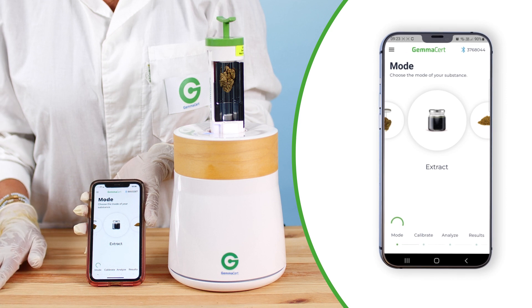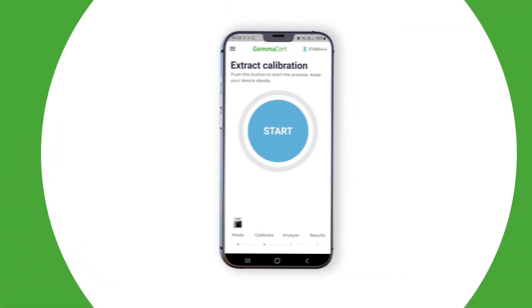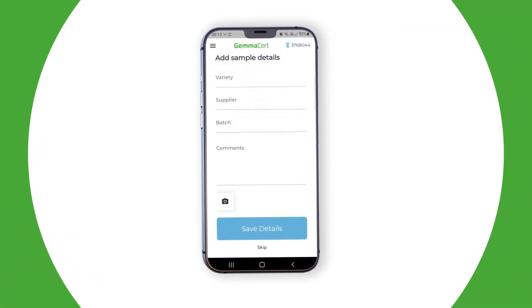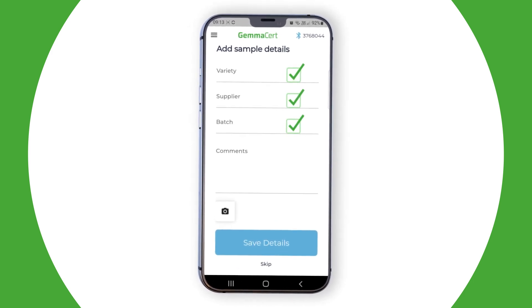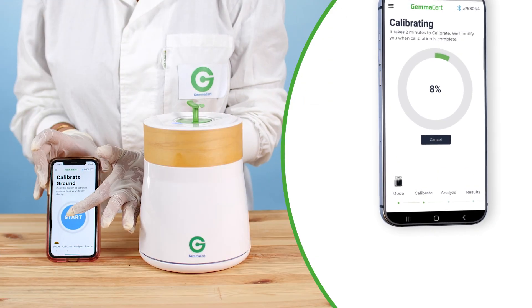Select Mode, followed by Extract, and then choose Calibrate. Now you may enter optional information about the sample: Variety, Supplier, Batch ID, and Comments. Press Calibrate.